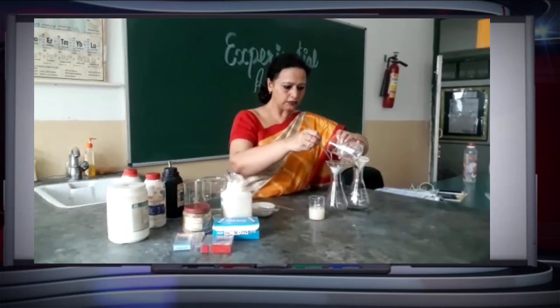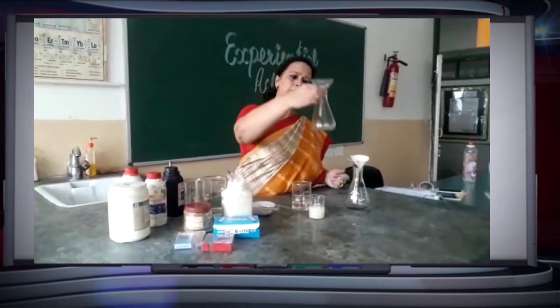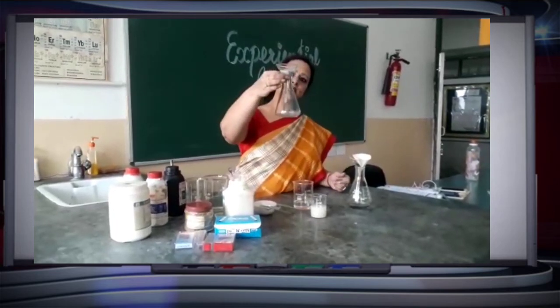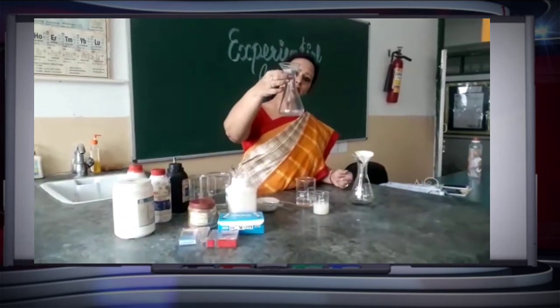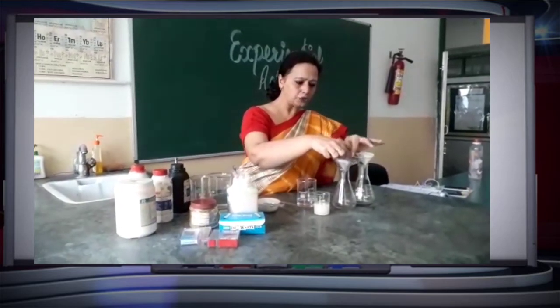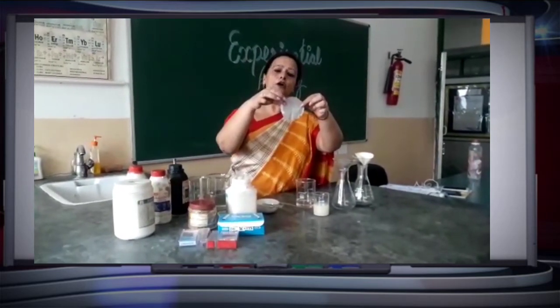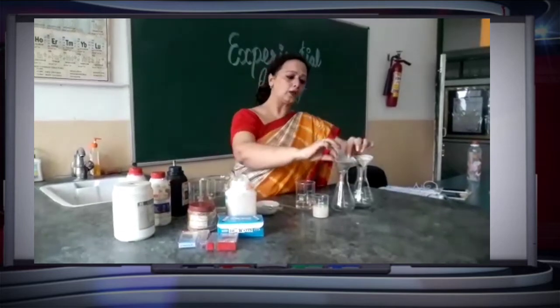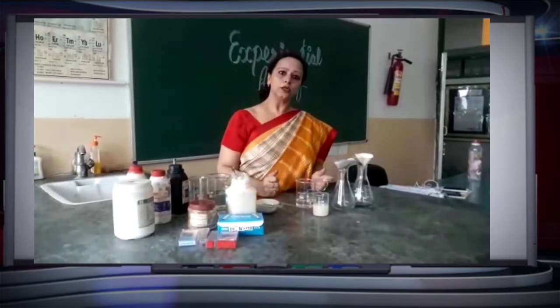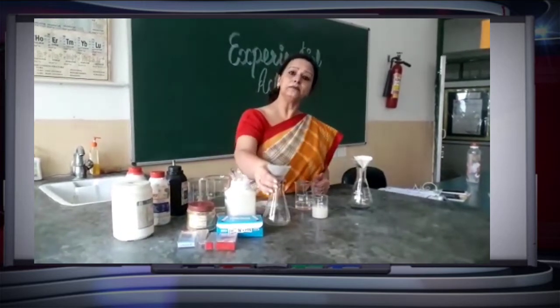We are filtering the true solution from the filter paper. You are able to see the filtrate which has come down is very clear. And if we check the filter paper above, there is no residue left on it. So this is the property of a true solution — the solute cannot be separated from the solvent by simple filtration.